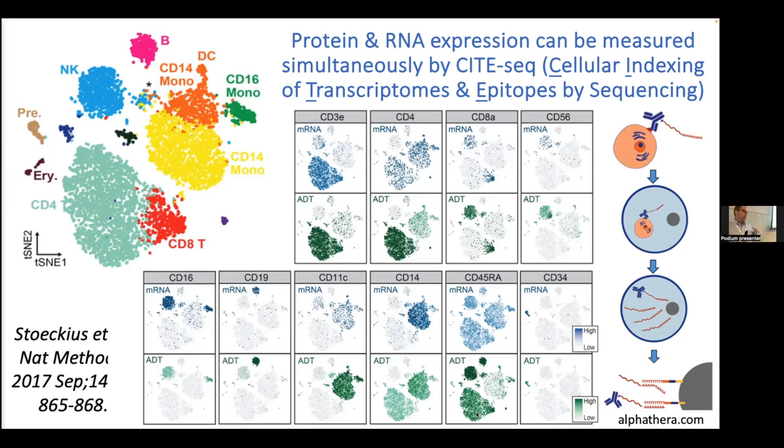It would help to a point. The way at least 10x sequencing works is it relies on poly-A priming and then an extension. But if that poly-A on your rare transcript just didn't happen to be primed, didn't have enough primer, or the primer just didn't find the poly-A, then you're never going to see it. You could sequence it to infinity and you still wouldn't see that transcript.